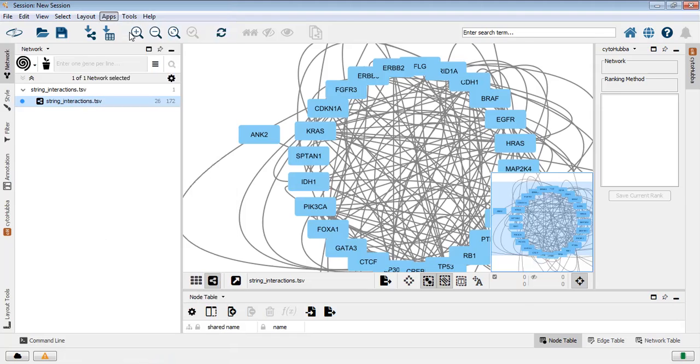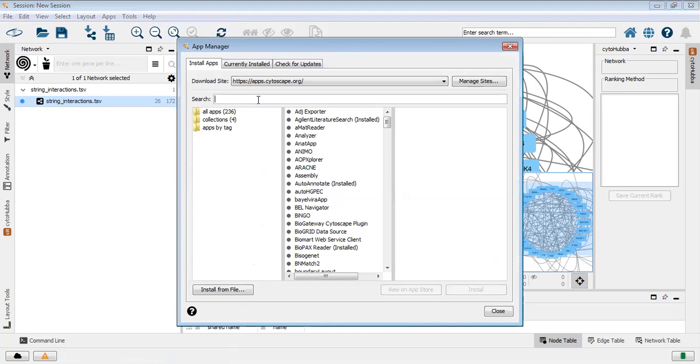In that you have to search different apps which are available for designing or for interpreting your network using certain plugins which are available in Cytoscape, which really help you to rebuild your network with respect to your interaction or your interest, whatever particular network you want to build.